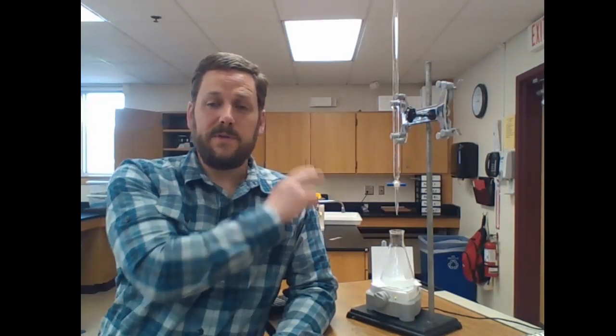We're going to slowly add titrant to analyte and see how much base is required to neutralize this acid. Now, I've rinsed the burette with the titrant to make sure that the concentration in the burette is known, and I'm going to add just a little bit at a time. But I'll need to determine how the pH of the solution is changing, and I can do that two ways. I can measure the pH with a pH meter, or I can use an acid-base indicator. In this case, I'll use an acid-base indicator.